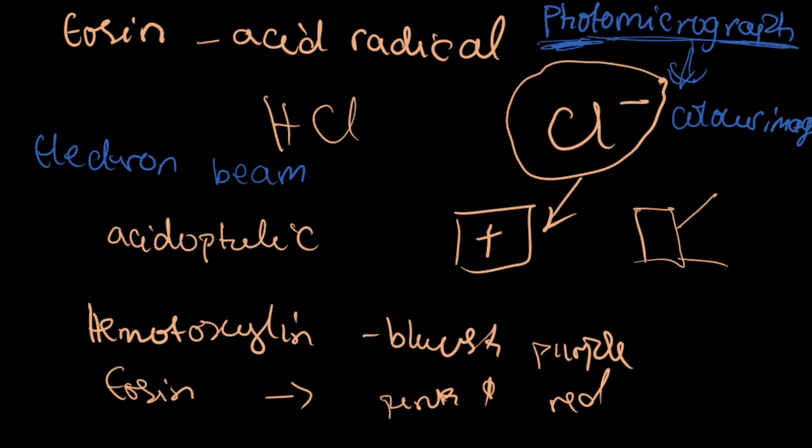However, as I was explaining, for the electron microscope what is used is electron beams, and these electron beams do not have a color spectrum. So as expected, the micrographs from an electron microscope would be black and white.